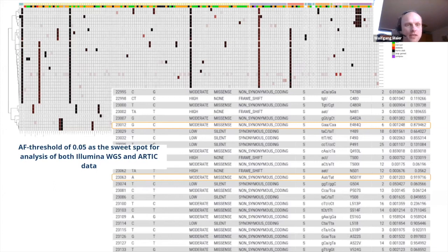And then the reporting reveals all the essential information from the VCF. It basically pools all samples together. We also have a per sample report, but this is the per variant report. So it pools the information from all samples and tells you which variants were found in any of these.